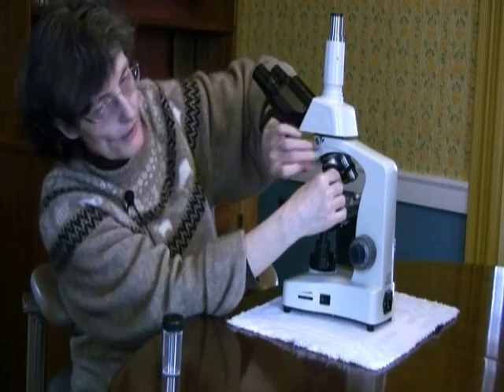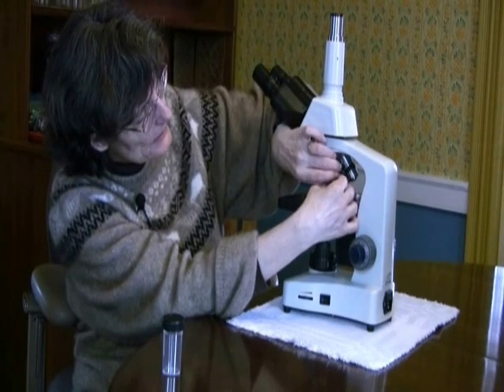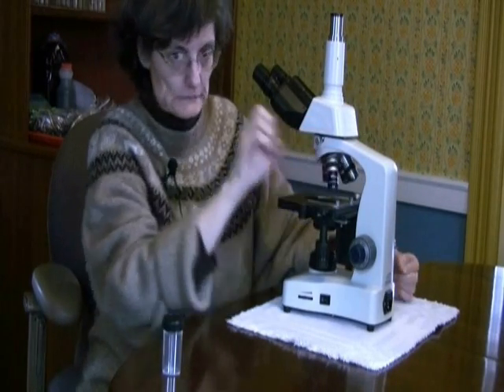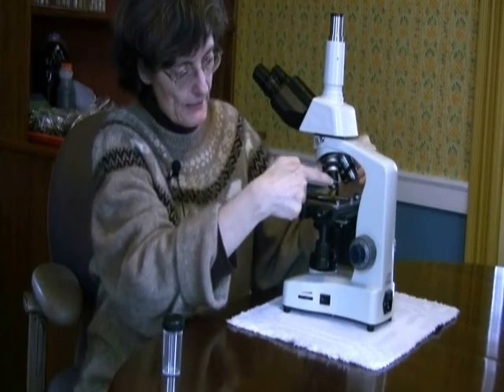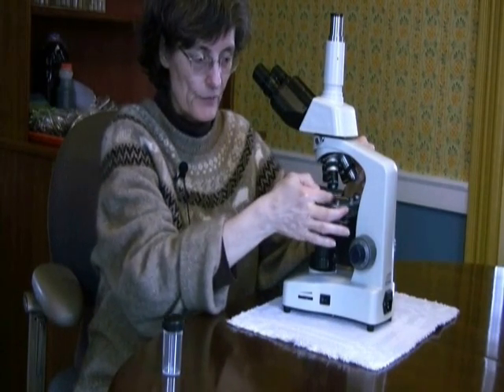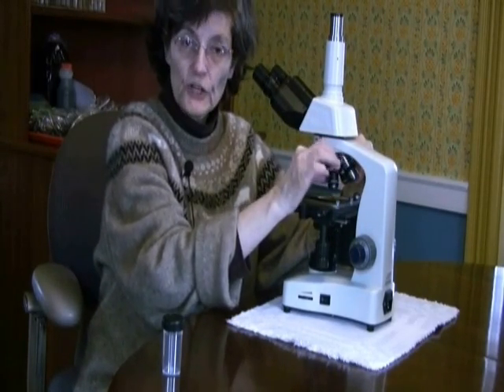Now on all of our eyepieces, we want to make certain we have the hole. Any cap that's here, you've got to remove it. So we just want to be a little patient and feel that the threads are starting to catch. It just takes a little patience to get it on there. And then you screw that in. Just like the headpiece, you don't crank it down because you'll just destroy the threads, and you are going to want to take these on and off every once in a while, especially if that objective gets smooshed into something, you know, oil or grease or something on your stage. You're going to want to be able to take this off and very gently dab a little cleaning solution, a little soap, maybe a little alcohol, and clean that lens off if you get dirt or oil or something on that lens. So don't push it down really hard, just finger tight, that's all.